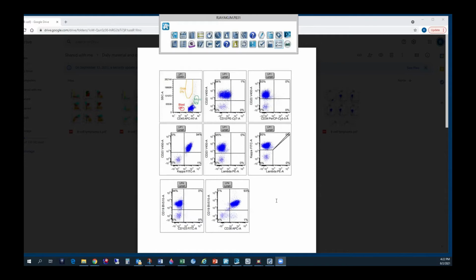So far the only percentage we have been asked for is CD20 expression on blasts, because that decides therapy. Nothing else have we been asked for a percentage. We either report positive, negative, dim, and then we use the word partial a lot. If something goes from this side to this side, we'll say partial, and we don't say how much percentage is on this side or that side. We don't go into that.